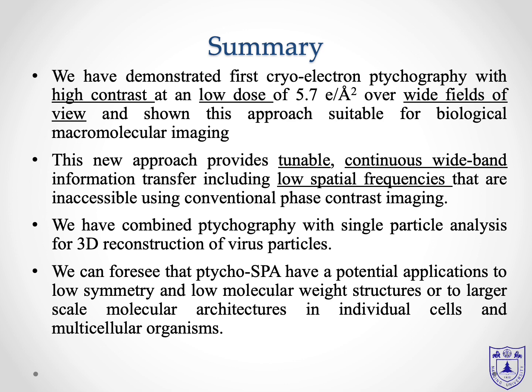We also have combined ptychography with single particle analysis for the first 3D reconstruction of viral particles. We can foresee that ptycho-SPA has potential applications to low symmetry or low molecular weight structures, or to bigger scale molecular architecture in individual cells or multicellular organisms.